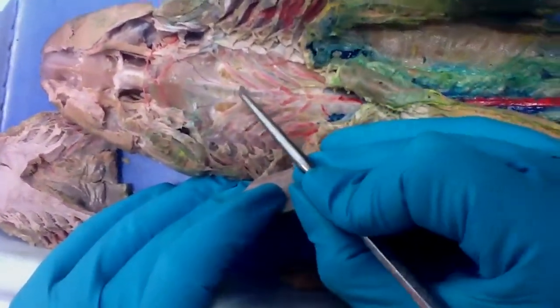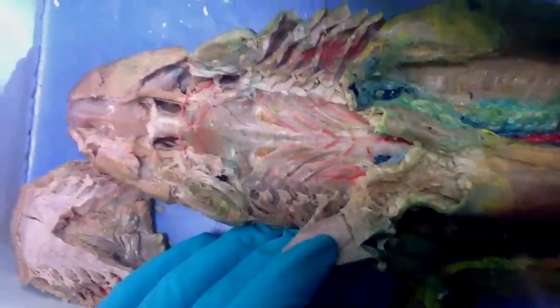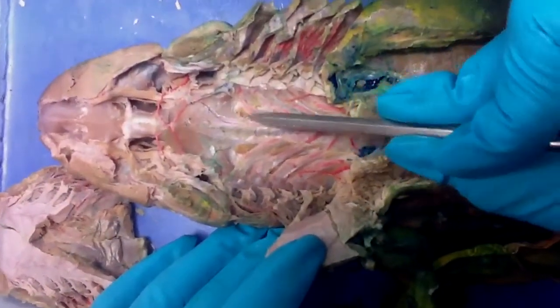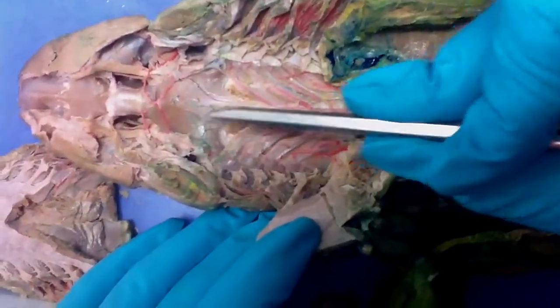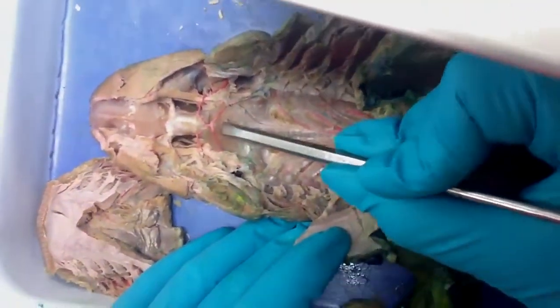And then this is the paired dorsal aorta, but only one side injected. Can you see it running right here? It didn't inject on this other side. And then it comes up to the carotid arteries.